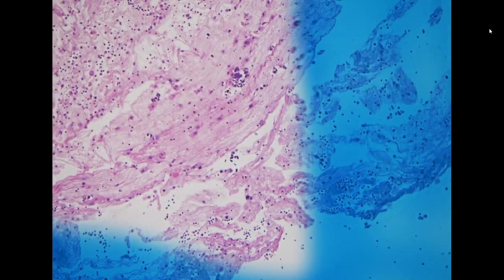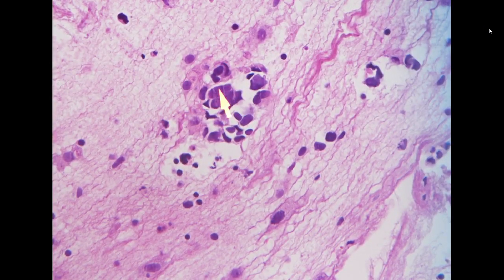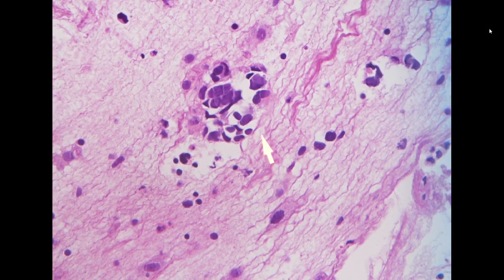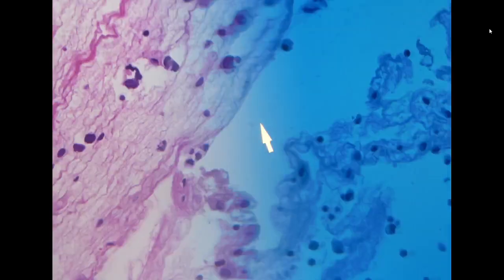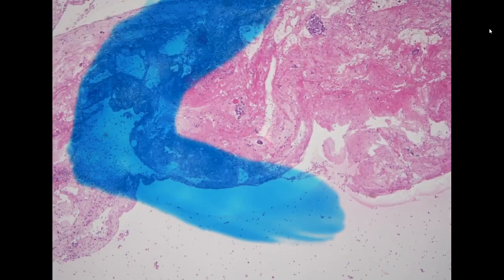In the cell block preparation, I think most of the cells look like small cell. So you have perfect molding and increased NC ratio. And the chromatin pattern is very homogeneous. It looks misty and a very, very fine granular pattern. So this is also typical for small cell carcinoma.